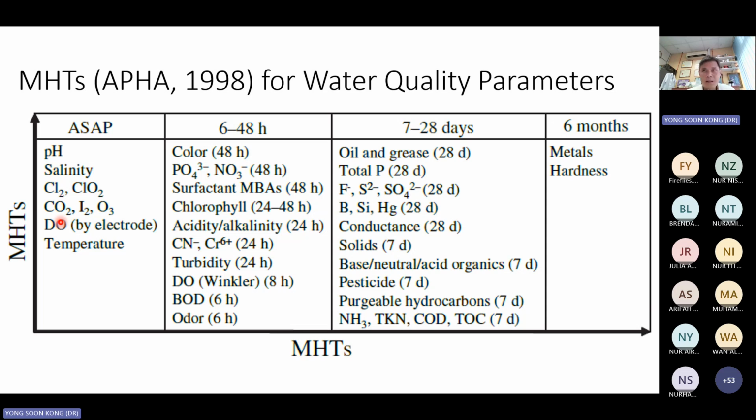Now there are other things that the probe can also measure, like salinity, temperature. That is part of the data that is presented to you. Even though you don't need it, you snap a picture or you use the data logger. Data logger is the equipment in the central panel that has memory to store it. I prefer you to take pictures. Every time you do a reading, take a picture and then you record it.